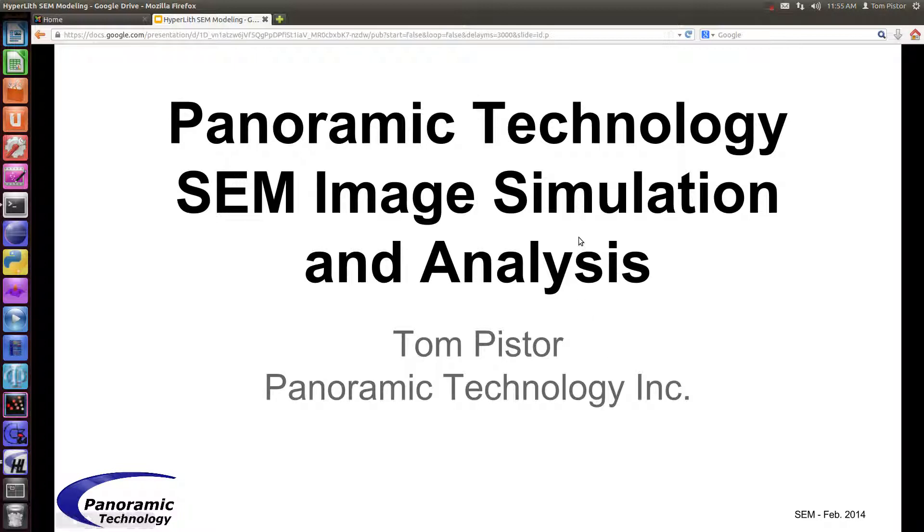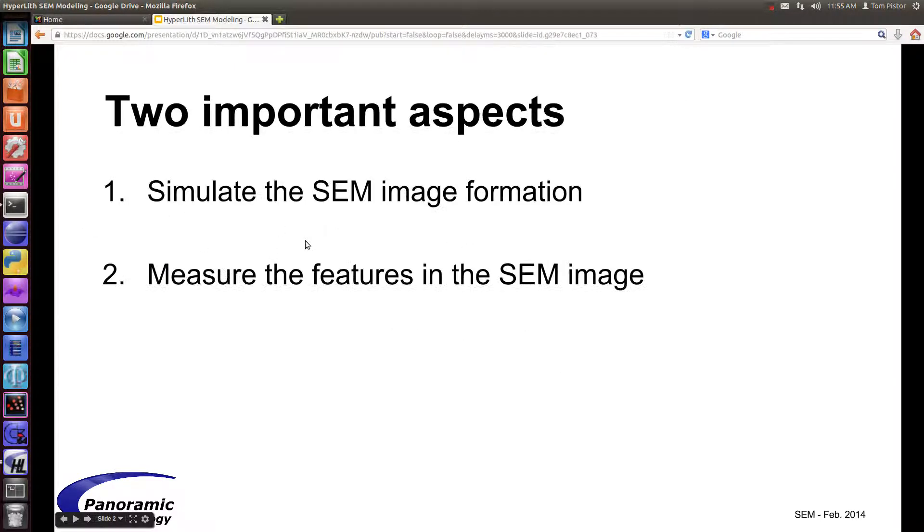In a previous video we talked about SEM image simulation, and in this video we're going to talk about SEM image analysis. But I'll briefly talk about SEM simulation just to put this into perspective.